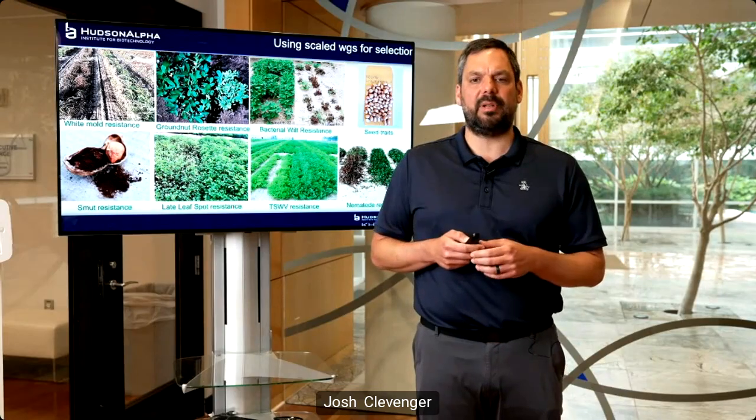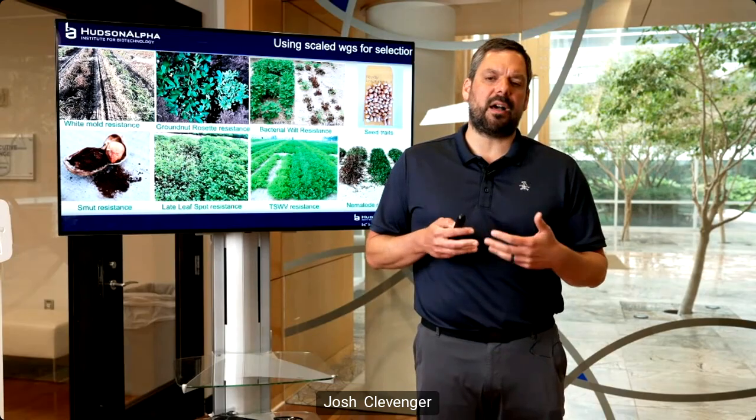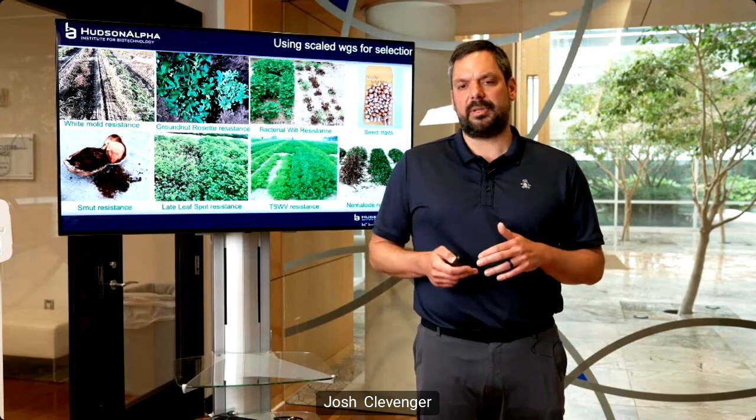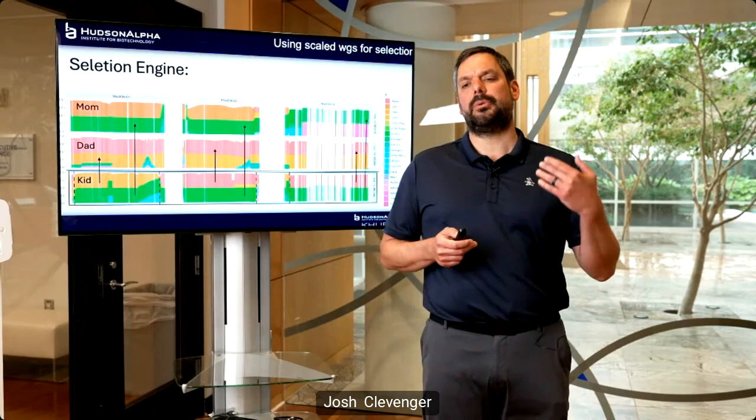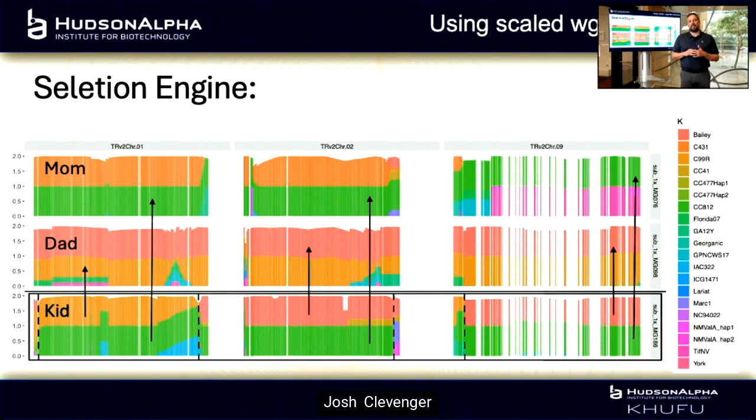And that's one of the things that my colleagues Justin Vaughn and Wally Karani and I have really thought about, how we do that effectively, for the past couple of years. And that's where it comes back to pangenomes. So imagine that your breeding program, and in our breeding program, we have genomes of all of the founders of our population. And so what I'm showing you is an illustration of how we use mapping to the pangenome to infer haplotypes of individuals using SkimSeq. And so the top one is 3 different chromosomes. They're colored by founder contribution.